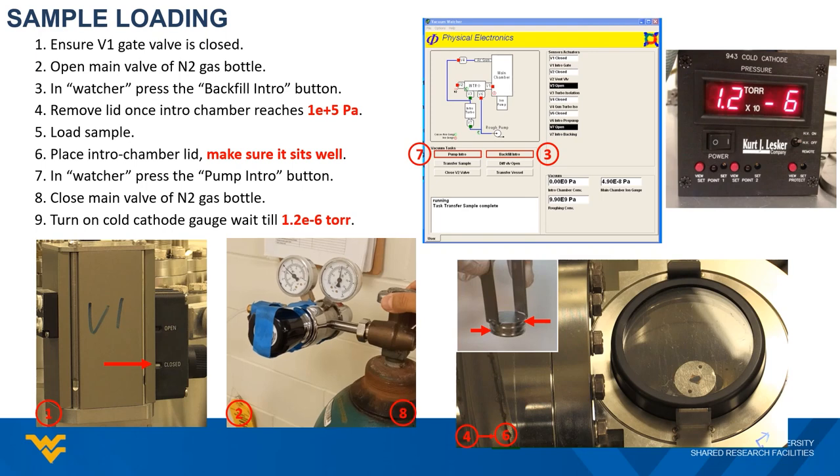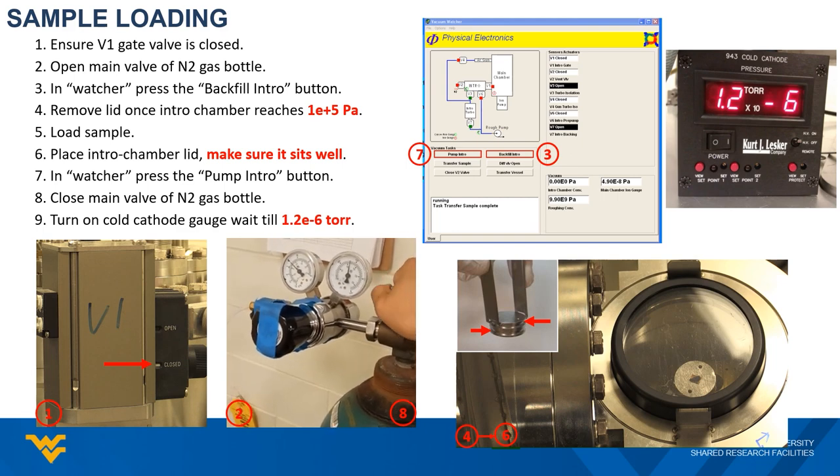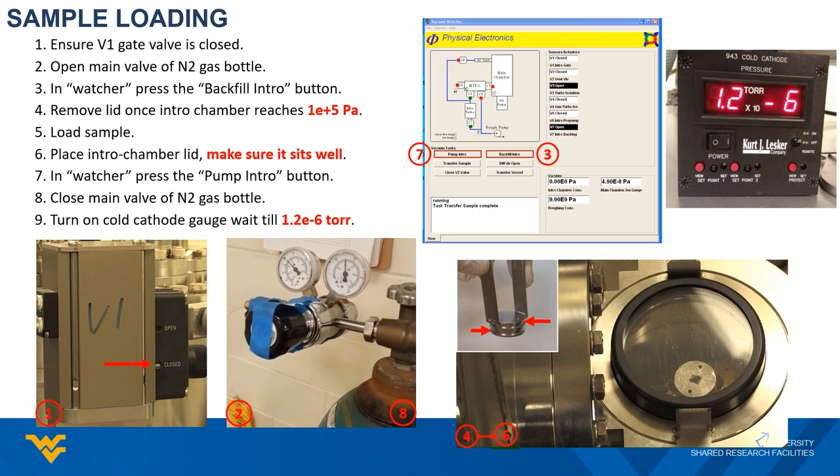Next, go back to the gas bottle and close the valve all the way. Finally, turn on the cold cathode gauge by pressing the main power button, then flip the high voltage switch from the off position to the on position. This allows you to read the pressure of the intro chamber down to the 10⁻⁷ scale. The sample will be ready for transfer once the reading is below 1.2×10⁻⁶ Torr.